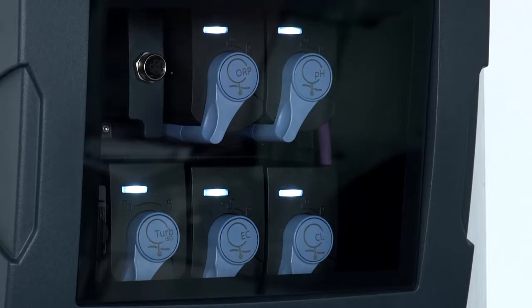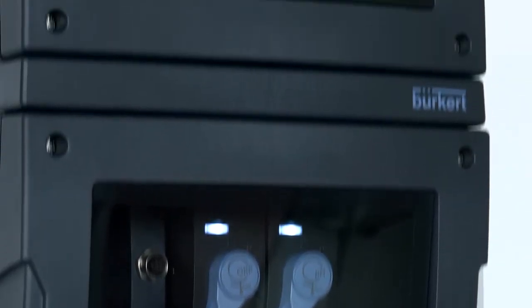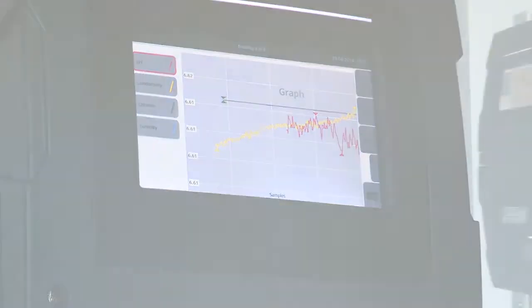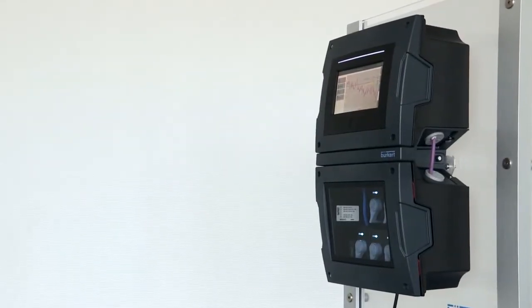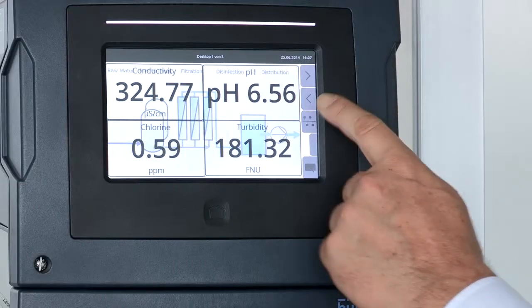Well, this is Burkitt's new online water analysis system. In general it's going to give us a measurement of water quality. We have a simple interface for the operators and, as you can see, we have these cubes at the bottom which actually do the measurement of the water.